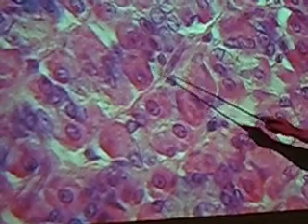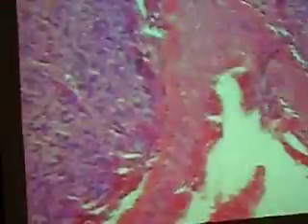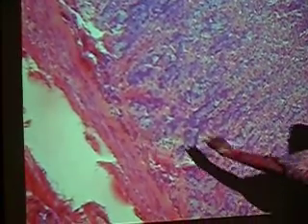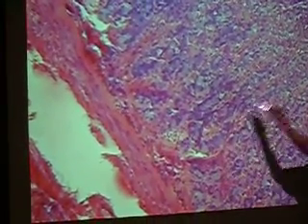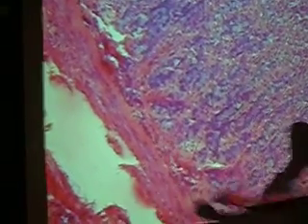Good. And what's the pink cell? Parietal cell. And what are all of these? Chief cells. Good. And just one more thing on the stomach, and that's a little tiny muscle layer at the very bottom. Yeah, muscularis mucosae. I don't know if you guys can see this little muscle layer at the bottom of all of that, that is muscularis mucosae, right above the submucosa there.